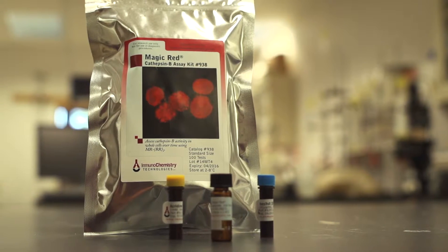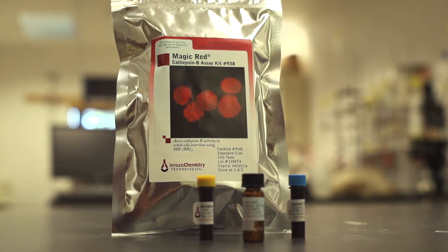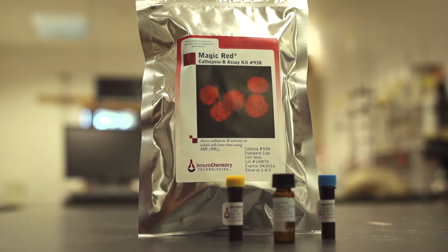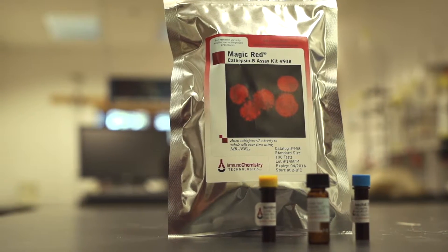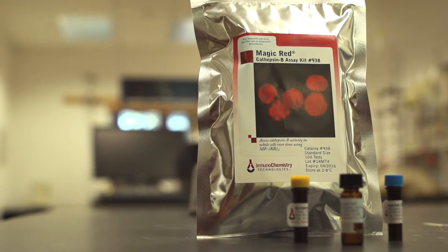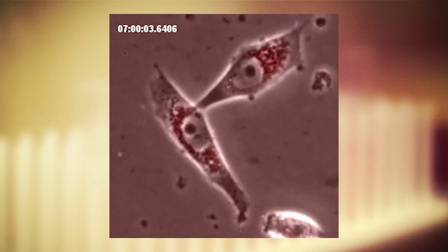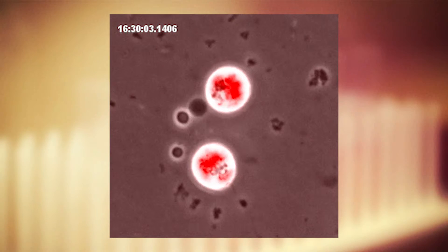Immunochemistry Technology's easy-to-use Magic Red kits enable researchers to quantitate and monitor intracellular enzymatic activity in whole living cells over time in vitro. Magic Red reagents are non-cytotoxic fluorogenic substrates that fluoresce red upon cleavage by active caspase or cathepsin enzymes.